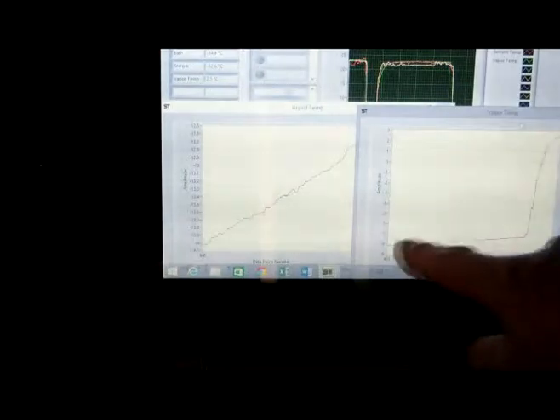Here's minus 13, and there was a flash. And if you look at the computer, let's turn the clock off. You can see the vapor temp here went up from minus 8 to 2 degrees, indicating that yes, indeed, there was a flash. And this indication is absent in all tests I've ever conducted with nPB. And that was a flashpoint of trans.